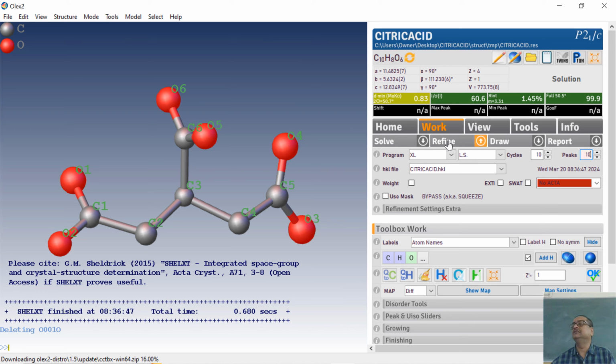So when you say refine, what the software is going to do? It will take these atom coordinates, find out the electron densities associated with those atoms, calculate the structure factor for all the reflections that are there in the list. It will calculate all the FCs. Then take a difference between FO and FC, calculate a delta F, and try to do an inverse Fourier transformation to find out what are the residual electron densities present in this structure.